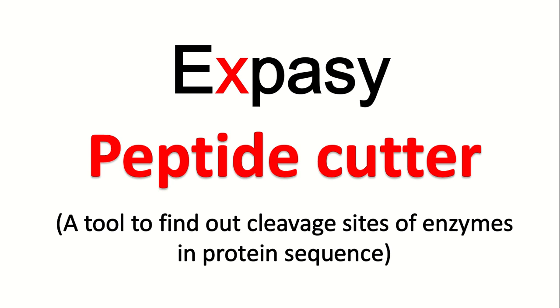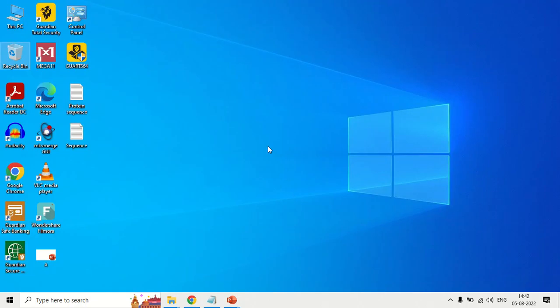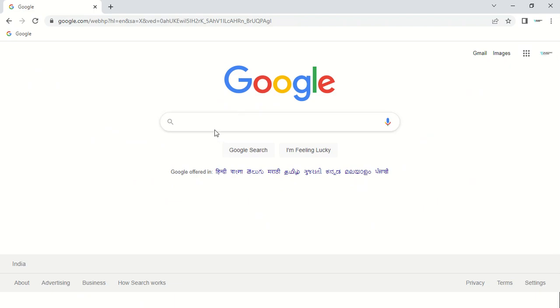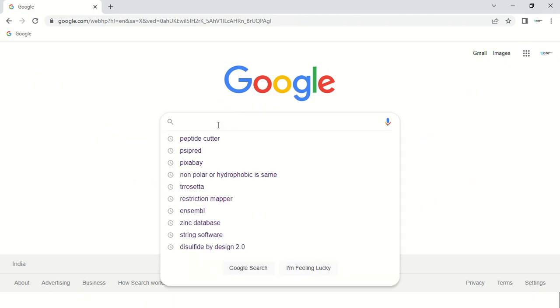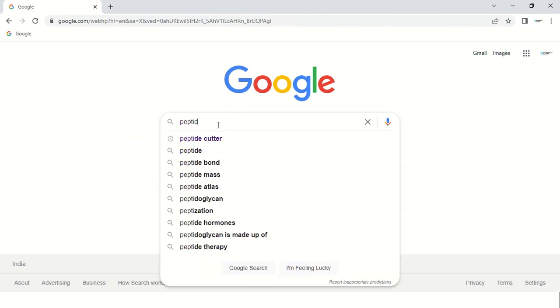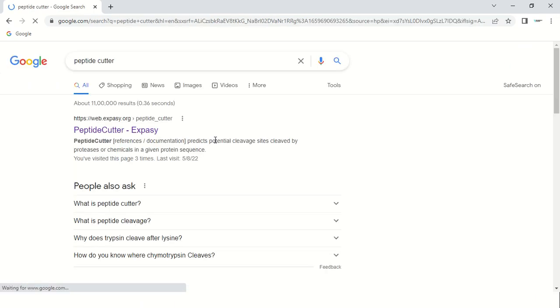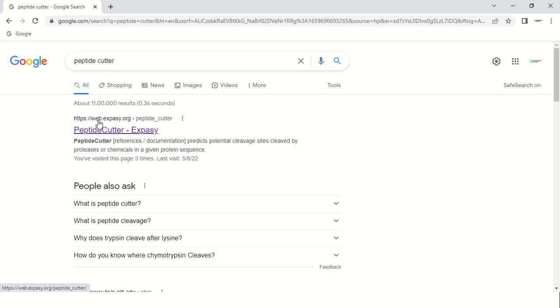So how can you use this tool? In order to access PeptideCutter, just open your browser and type 'peptide cutter'. In the search results, the first website that appears is web.expasy.org. Just click on that website.